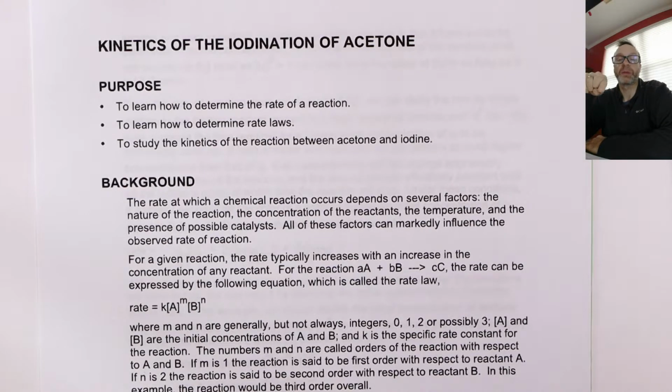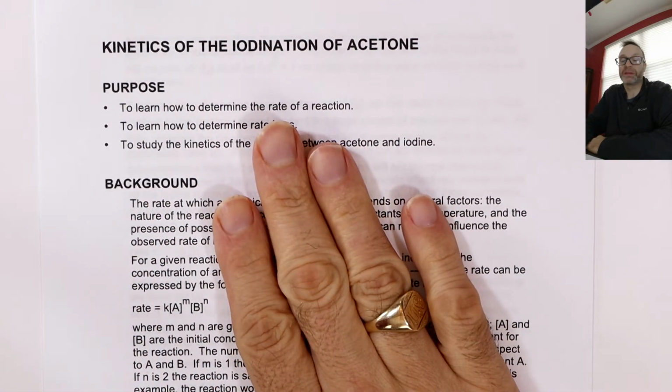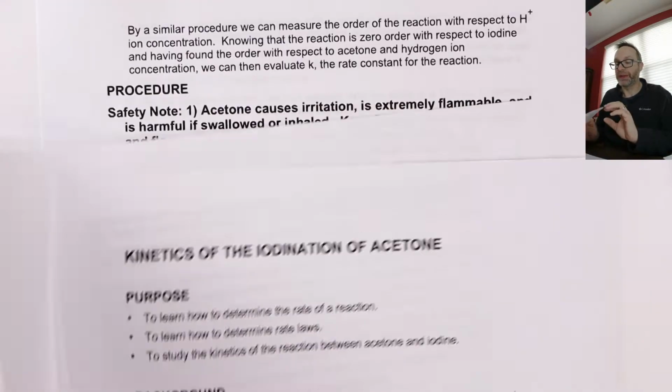So you're going to go to GRP 102, download the experiment package, which you'd bring to lab in a regular semester, and then you're going to download a data set based on your birthday. So make sure you follow the instructions at GRP 102. It's a little bit different than the ones we've done so far, in that it's not, repeat, not a pivot lab. Now my pre-lab basically follows through what's talked about here, but in the way I talk about it. So let's take a look.